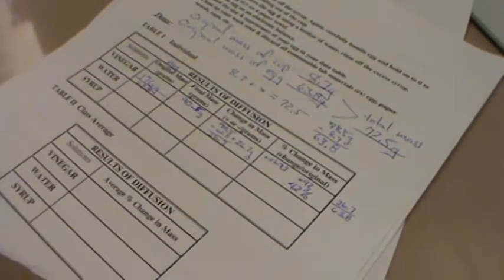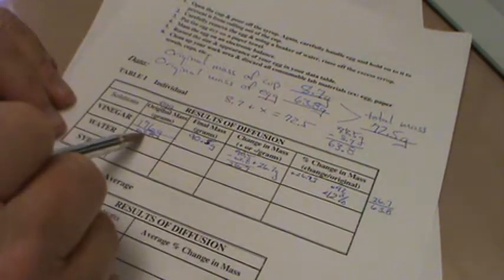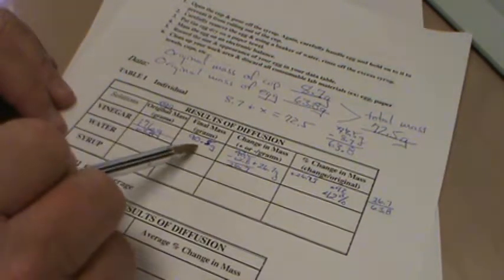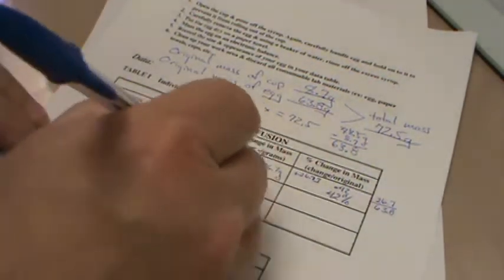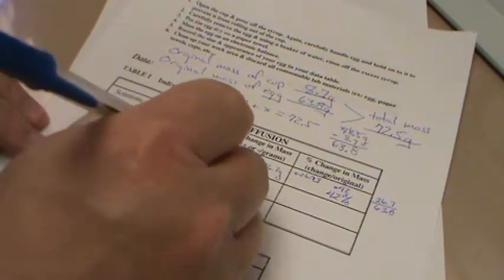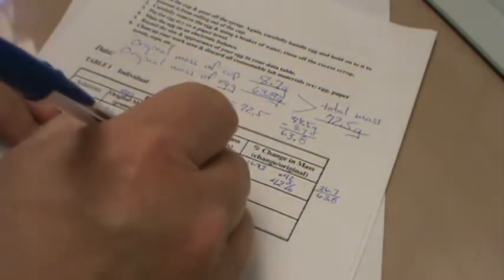So as we go down on our table, the original mass that we started at was 63.8. When we added the vinegar, we were able to increase it to 90.5, which is where we start theoretically here. According to our scale, we're sitting at 104.5 grams. That is quite a significant increase.